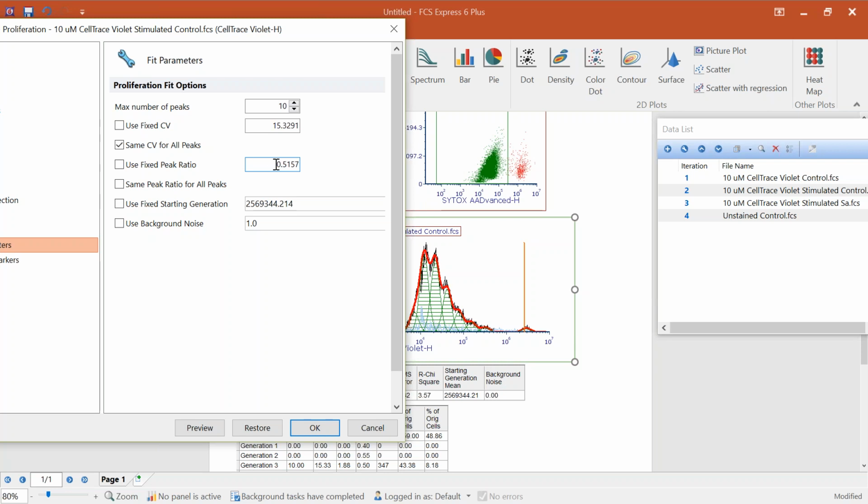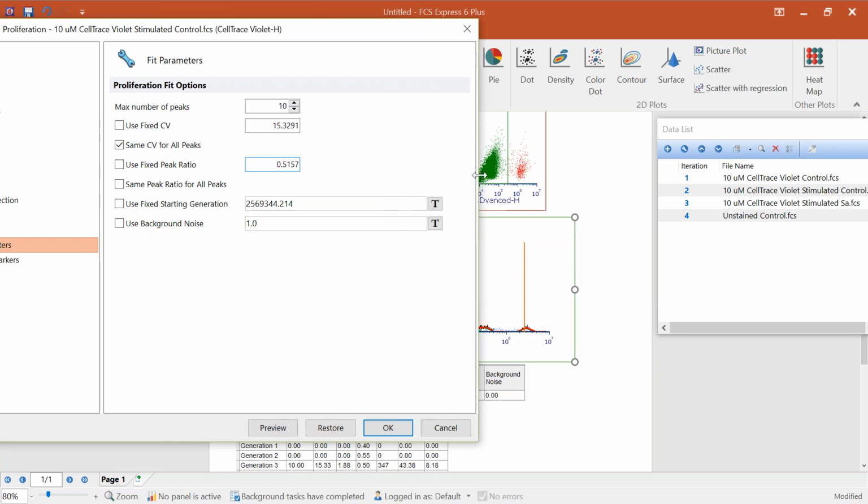If you're finding that you're having to change every single parameter in here to fit your data better in one way or another, you're getting very far away from the theoretical model, and your data is probably not approximating the model as it should be. So you can use these tools to your advantage, but then again, don't go too far outside of the constraints set by the defaults, because your data probably isn't matching up as nicely as it should be.